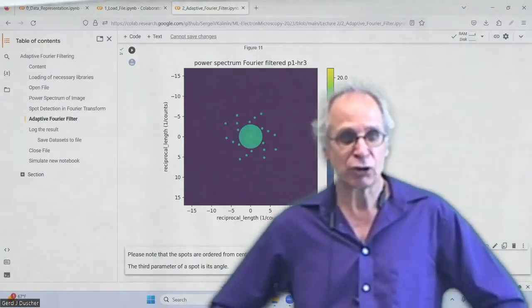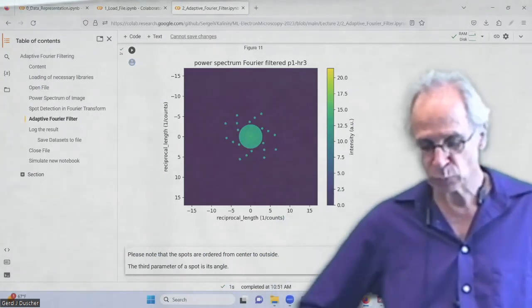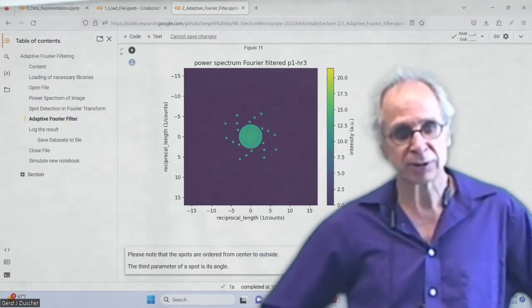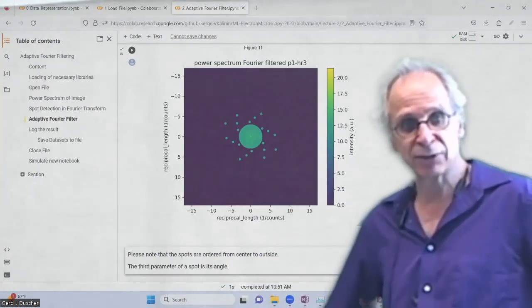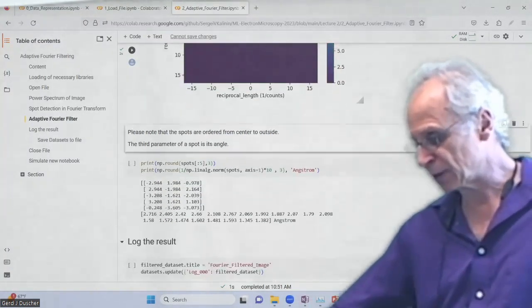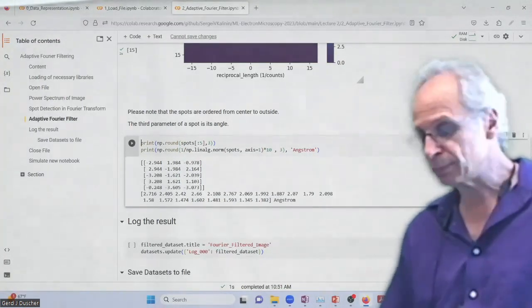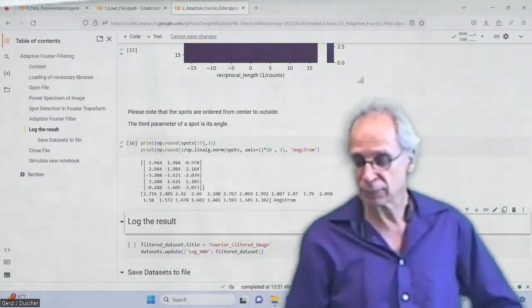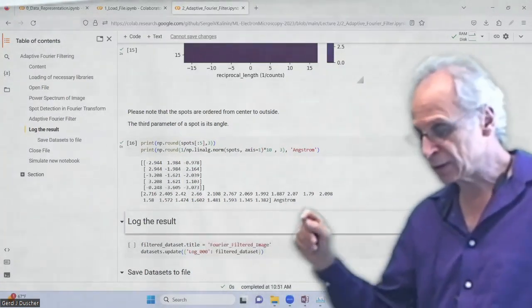If you do the same thing in Digital Micrograph or any of the other imaging software, then you have to select all the dots. You have to make sure that you're really on it. It's very hard to determine the size of them, and so it's always a little bit awkward. But here, that's where it's a bit nicer. But we can go back and do more than that. We can look, where are these peaks? So it gives me now the distances. I calculate the distances here.